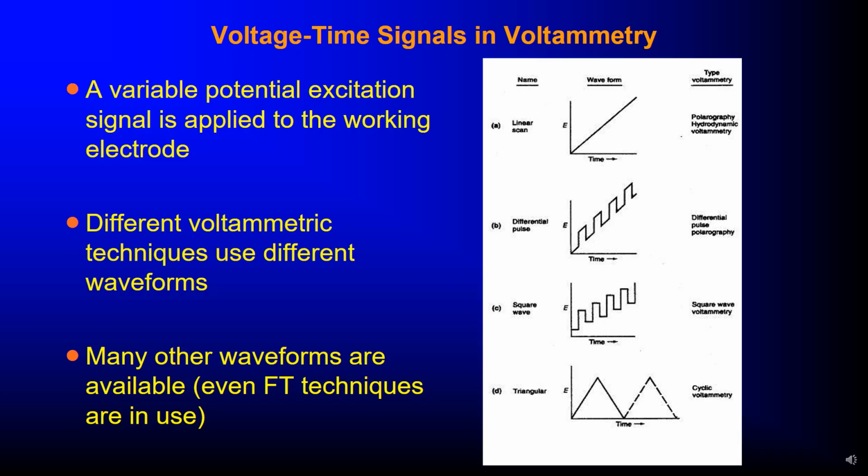We also have cyclic voltammetry. We also have anodic stripping voltammetry. We also have cathodic stripping voltammetry, and we also have adsorptive stripping voltammetry. So there are very many. Also we have alternating current voltammetry, and lastly we have polarography.